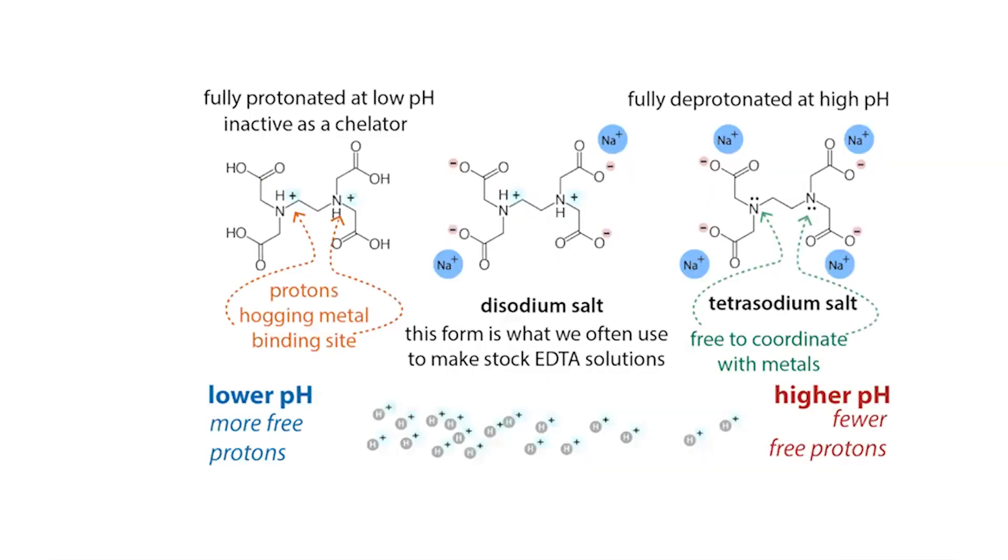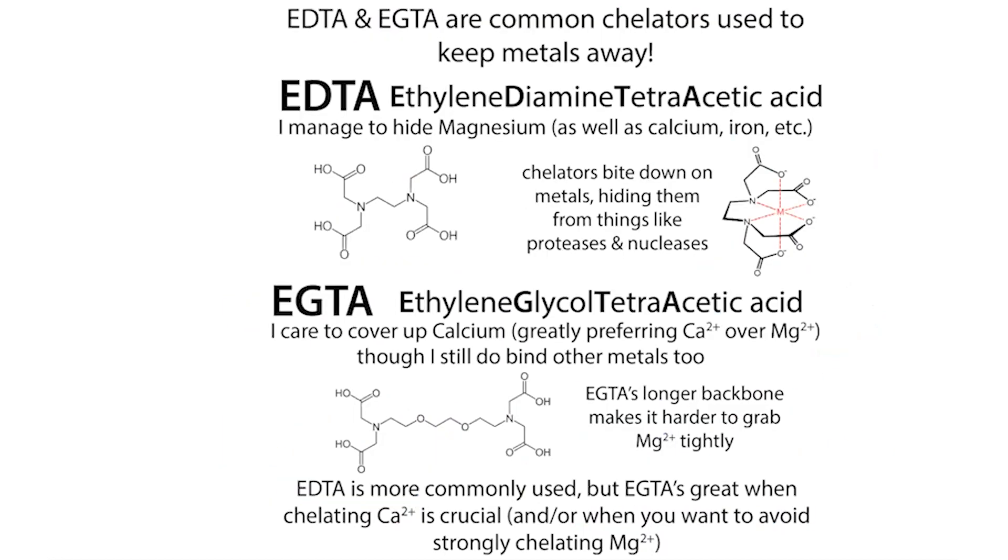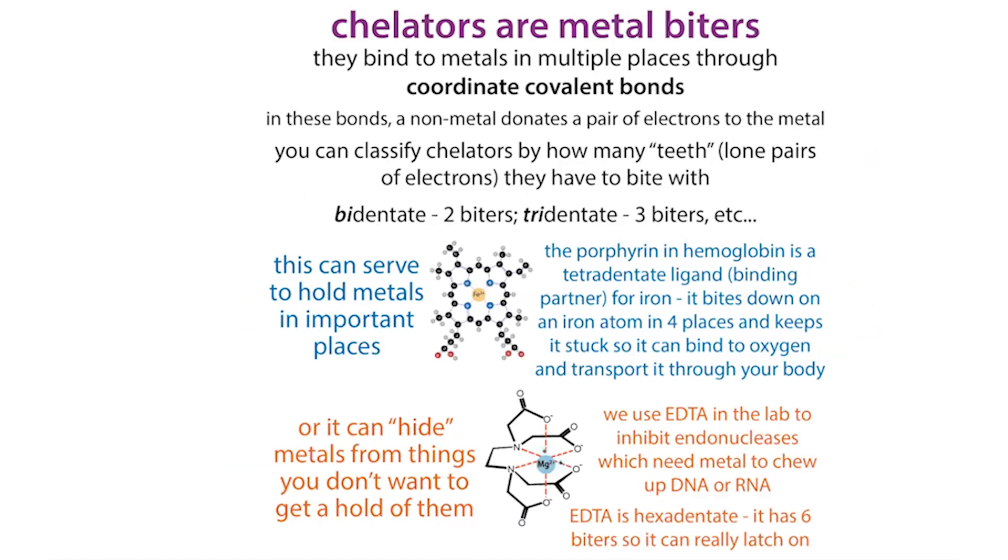That was the Tris example — a common one that can trip you up. Tris-HCl sometimes goes by the trade name Trisma, but you don't have to remember all that; just remember to look at the bottle. Another time it's really important to look at the bottle is with EDTA — ethylenediamine tetraacetic acid — which is a chelator, or metal biter. It bites down around metals and hides them, which we use to protect molecules from nucleases, things that can chew up DNA and RNA.